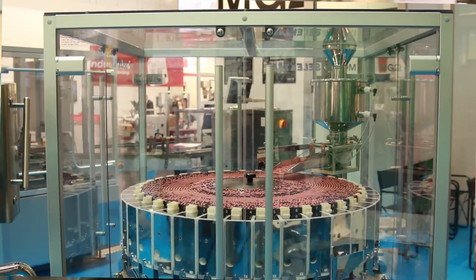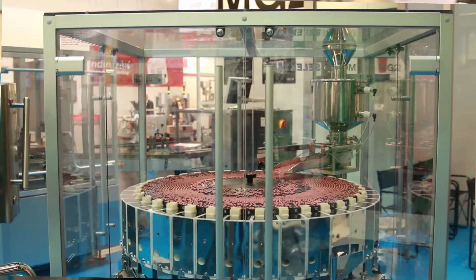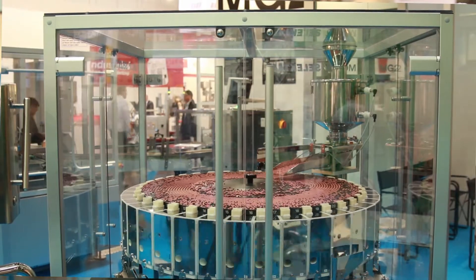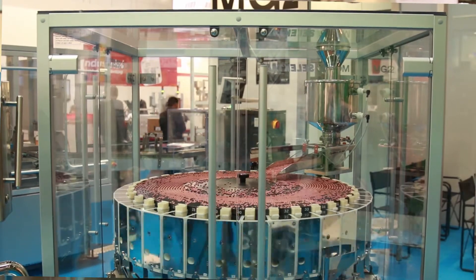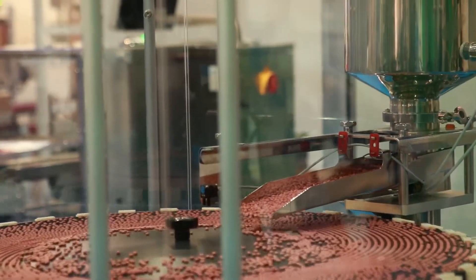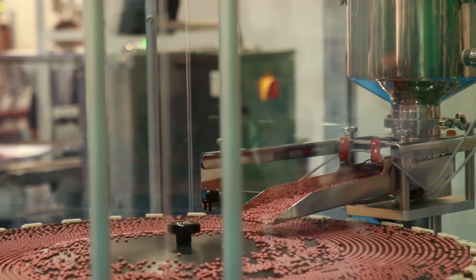It's already 21 years that I work at MG2, and I present now the Selecta Machine, which is a new machine from MG2 to check the weight of tablets — mainly tablets — 100%, so each single tablet is checked, and it has a very high speed.